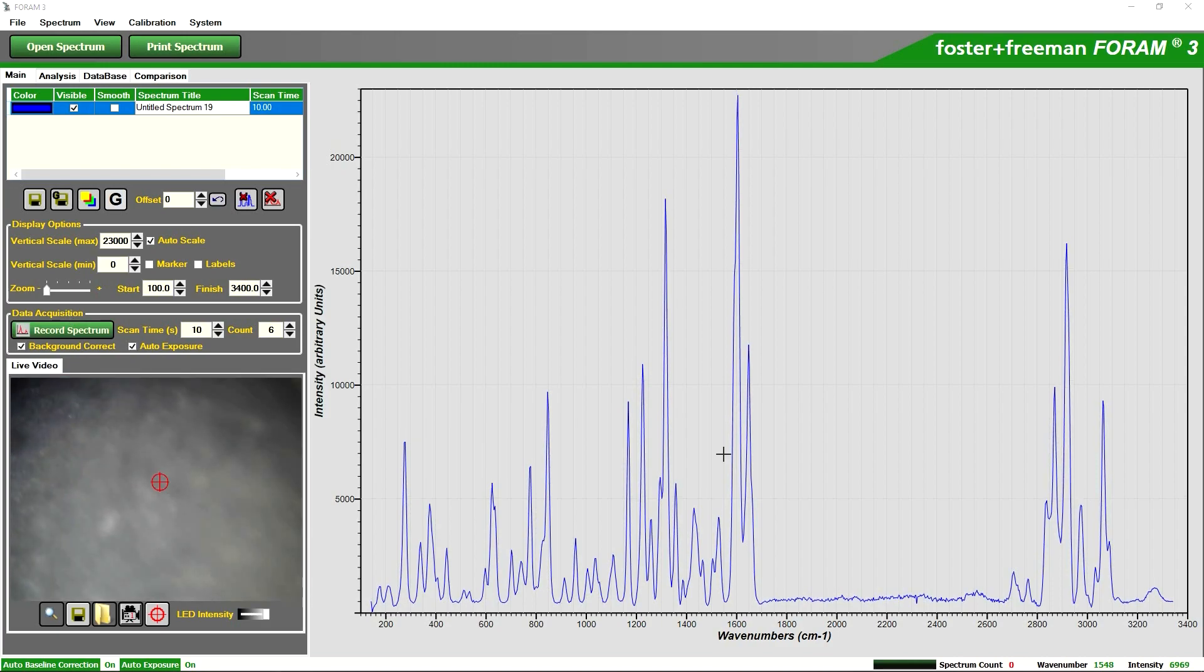Here we have the result of our unknown sample. To quickly explain our graph, on the X axis we have our wave numbers and on the Y axis we have our intensity.